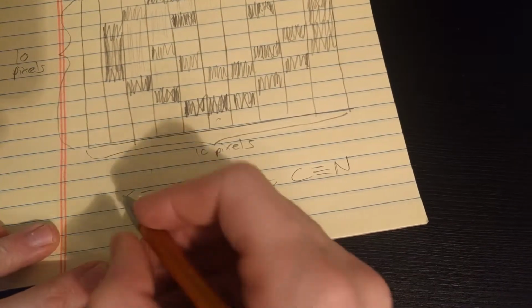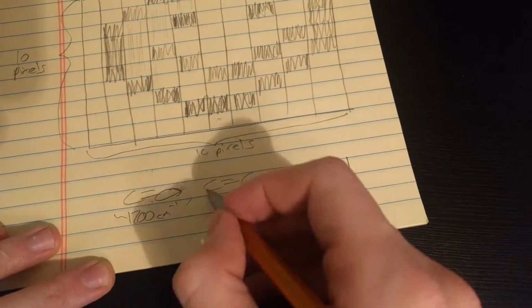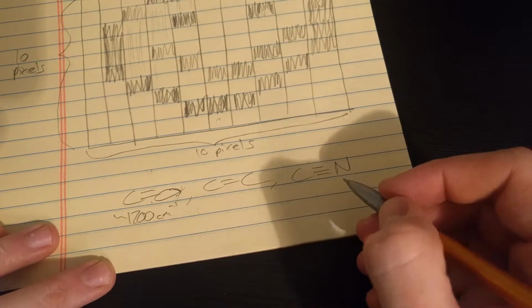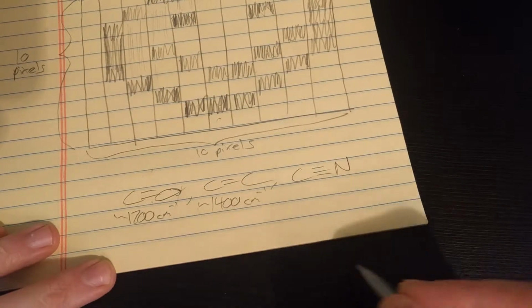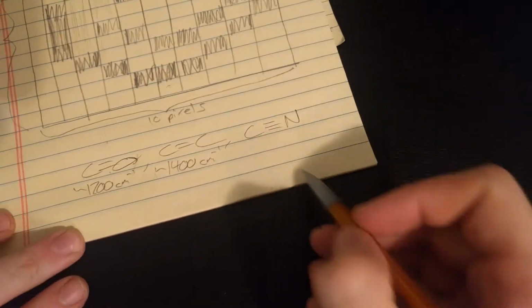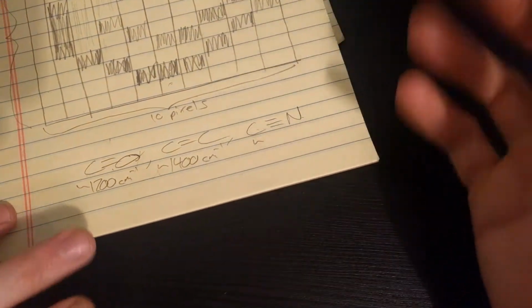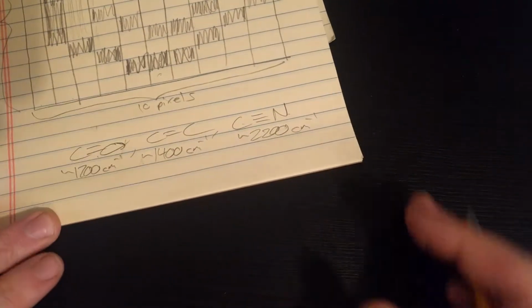So this carbonyl mode is going to show up around 1700 wave numbers. This CC bond is going to show up, I actually don't even know, maybe around 1400. But that might be completely wrong. And the CN bond is going to show up, I also have no idea, maybe around 2200 wave numbers.